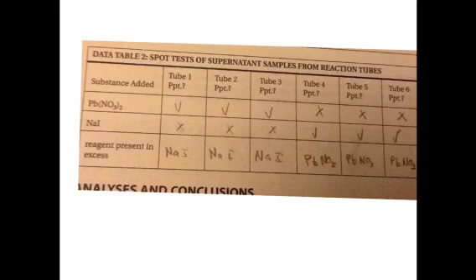That explains this table we have here. You can see which ones reacted: in tube number 1, PbNO3 reacted in the first 3, and NaI reacted in the second 3, so we had excess reagent of sodium iodide in the first 3, and excess reagent of lead nitrate in the last 3.